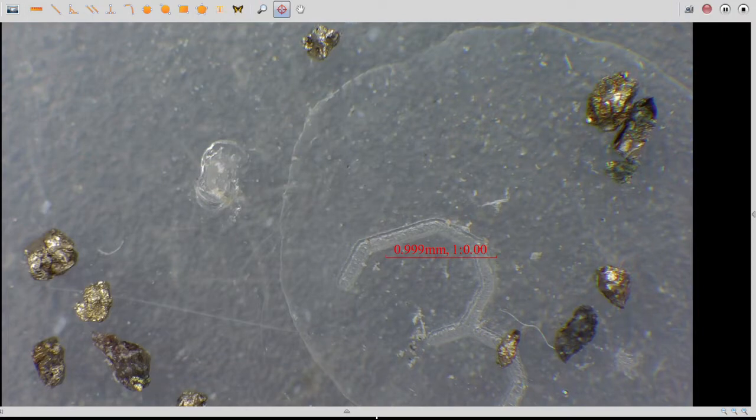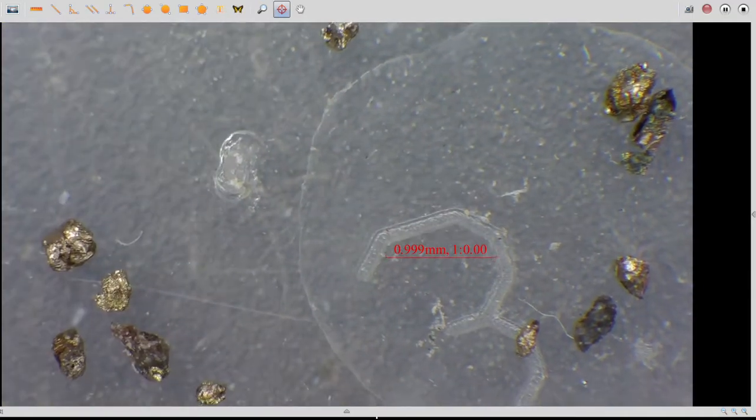So this is a monomineral. I mean, all grains consist of only one mineral. These are not intergrowths or inclusions of various minerals. All grains consist of only one mineral.